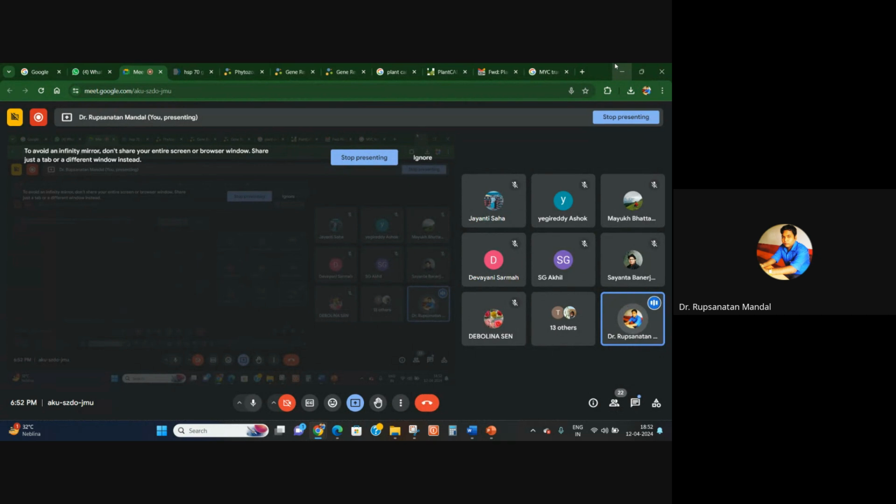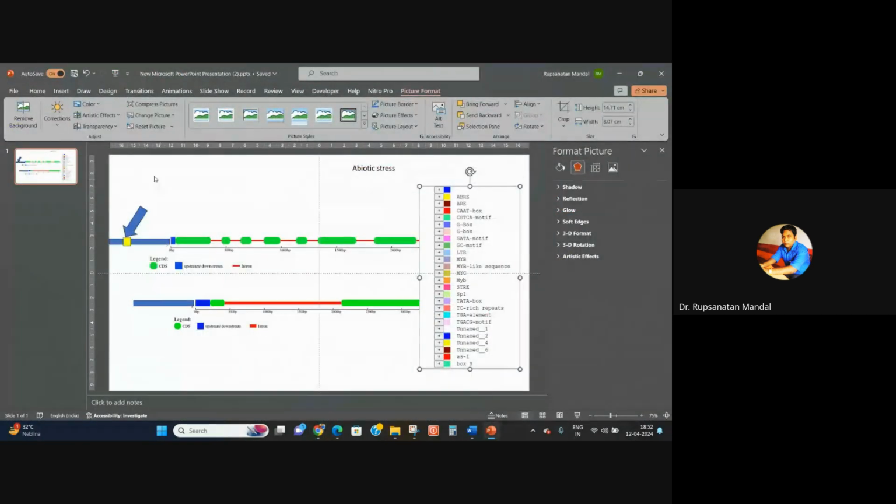Okay, we selected some genes, like MYB genes. We want to check the expression level of the MYB gene in the resistant plant compared to our control plant. So this is the situation. We can do real-time PCR. Sometimes we can quantify things like virus inoculum, but today we are discussing gene expression in qPCR. So this is the situation in qPCR.